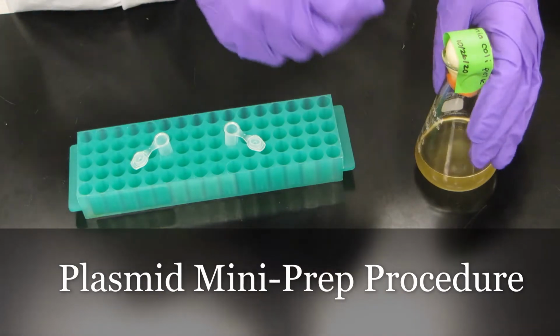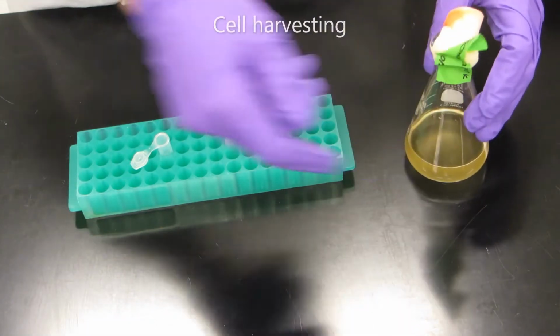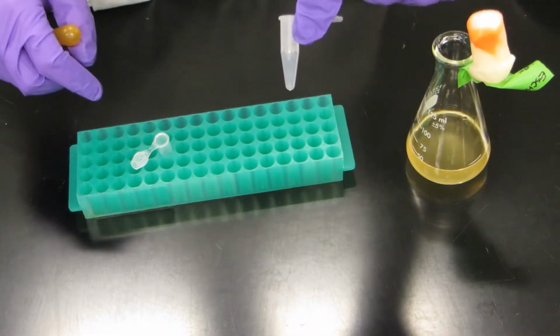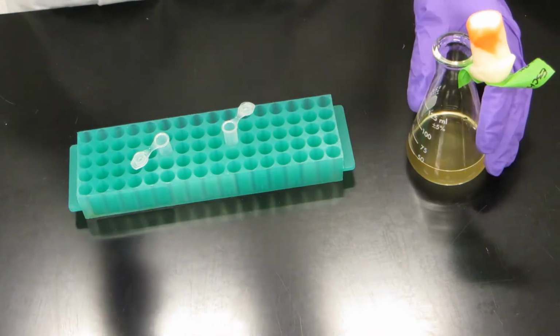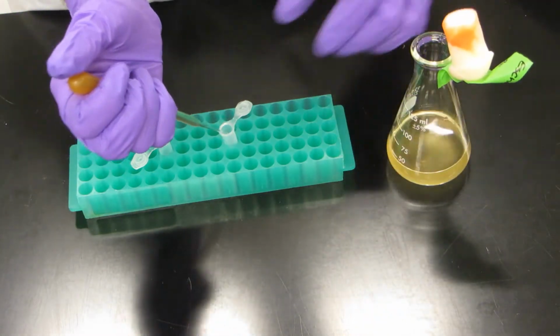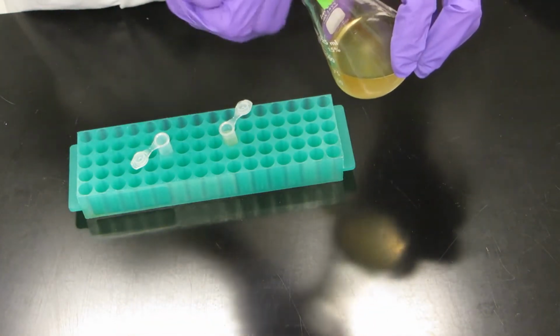The first part of the plasmid prep involves the harvesting of the E. coli cells. So I have this flask of culture here, and what I have here are some microfuge tubes. So these are 1.5 milliliters or 1,500 microliters. What I'm going to do is basically put the E. coli culture into these microfuge tubes and fill it most of the way to the top.